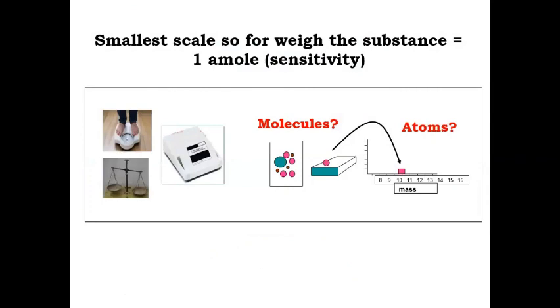So we should know what mass spectrometry is. Here the word mass means the weight of molecules, and spectrometry is related to spectra. I will tell you the difference between spectroscopy and mass spectrometry. Sometimes during examinations, students write mass spectroscopy, but I think that term is wrong, because spectroscopy means electromagnetic waves interact with the molecule and we get spectra.